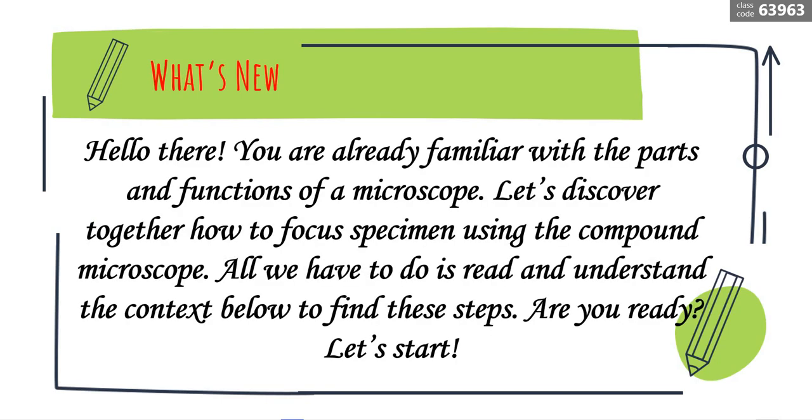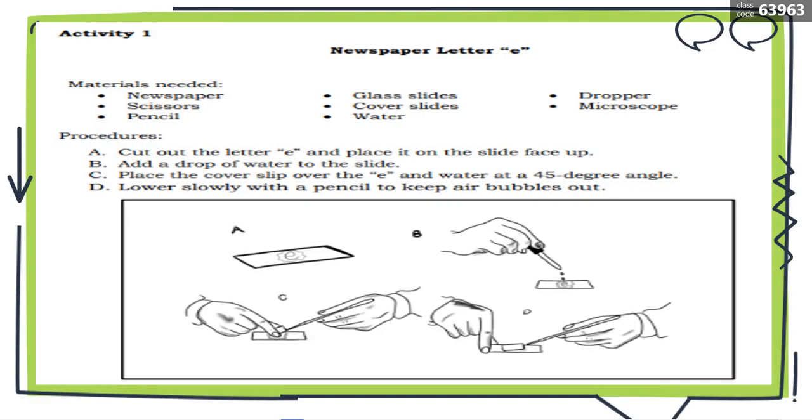What's new? Hello there. You are already familiar with the parts and functions of the microscope. Let's discover together how to focus specimen using the compound microscope. All we have to do is read and understand the context below to find these steps. Are you ready? Let's start.